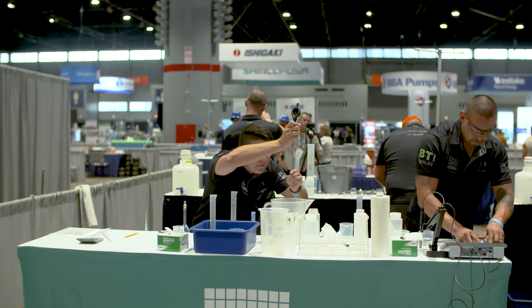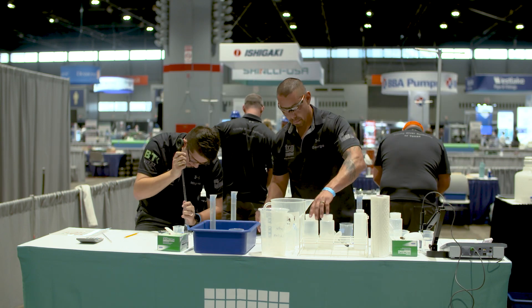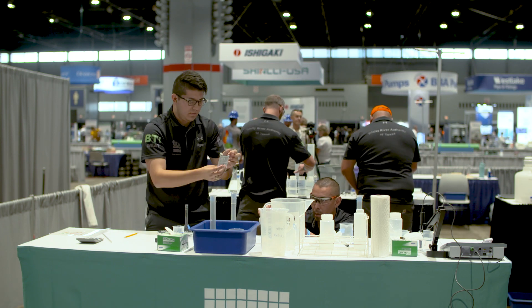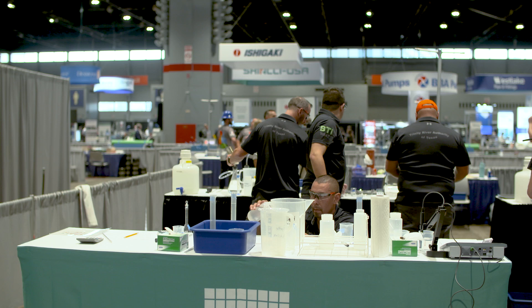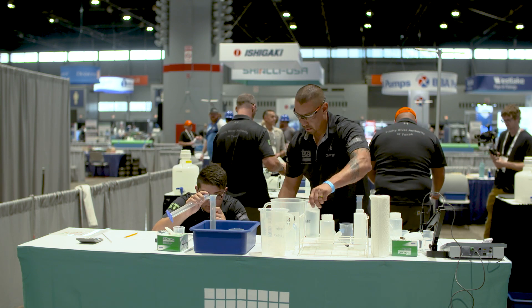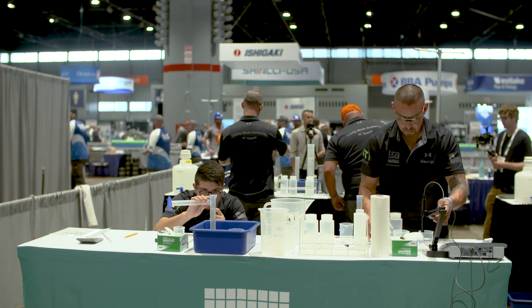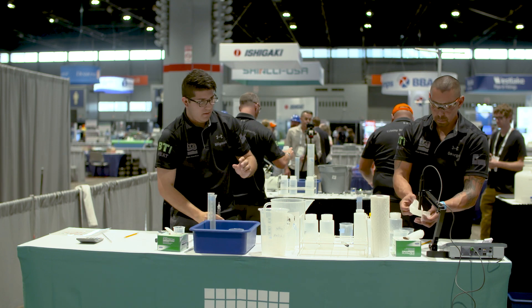Moving back to table two. Both competitors are now working on sample prep — the reference standard, one of my favorite parts of this event because it's so applicable to your daily job. You have to calculate a target reference concentration and make sure that you choose the right glassware — either a 100 mL volumetric or a 200 mL volumetric — and perform that calculation correctly. Pay attention to the meniscus on the volumetric glassware. The better you perform this task, the more time you will get back — up to a minute if you are within 10% of that target value, or 30 seconds if you are within 10 to 20%.